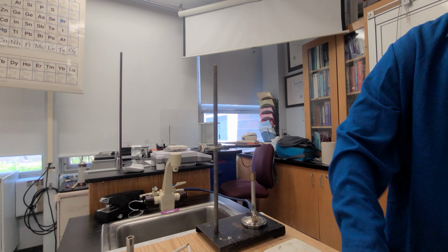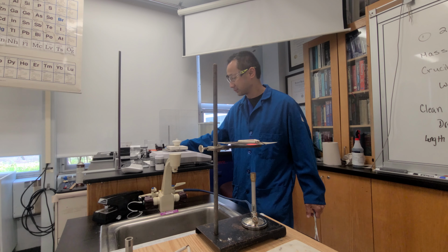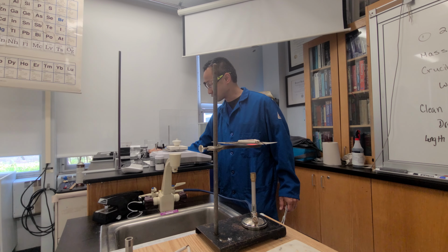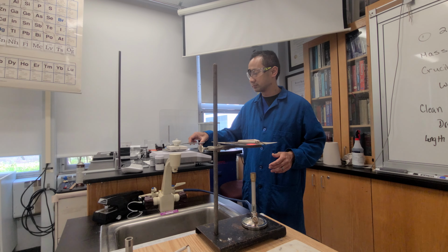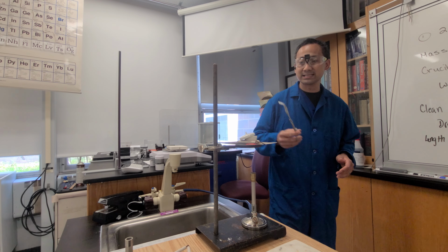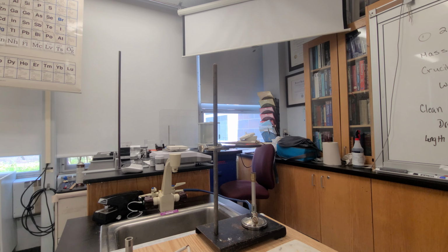So this is good to go. I'm going to get some masses on it, and what I'm trying to do is get a mass where it is technically 0.005, I believe, is what the scale can, what I have my students ask for. It's 38.02, so actually hundredths of a scale. So the first measure is 38.02. That's empty. I'm not anticipating a huge amount of change.